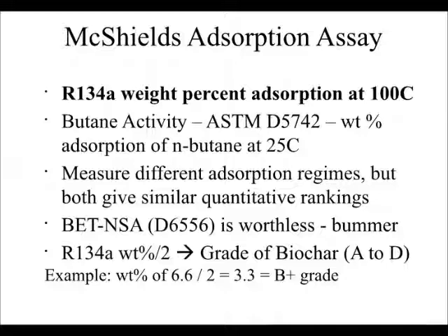And the reason is it's done at liquid nitrogen temperature, minus 176 degrees, or something, wherever liquid nitrogen hangs out. And what happens, and we wrote papers on this, I've done papers with Micromeritics, in that temperature regime, two things happen. The first thing that happens is the tars, the mobile matter, freezes into a solid. And you start counting it as if it was surface area. And upon heating it up and putting it in the soil, it goes back to being an amorphous material and doesn't have that surface area. The other thing that happens is you don't get any diffusion. So the amount you get in is really not very reproducible. Very much a function of the macropore structures, diffusion in and out, at least kind of diffusion length. So bottom line, nitrogen is not good because of the temperature.